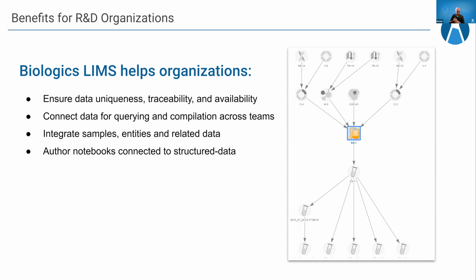Then there is connecting data for querying and compilation across teams. I guess I'm going slightly out of order, but that's all right. Another effect of the previous point is that having all of that data connected means that you can query across it. You can ask questions of that data that is connected, including data produced across multiple teams. It just becomes so much simpler.